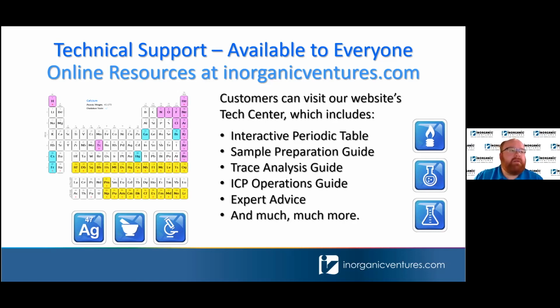Great, thanks guys. I think we might be getting down to the end here. I'm considering using peroxide for sample preparation for a low-level silicon analysis by mass spec. Is there an appropriate range to keep that peroxide concentration at or below for mass spec work?